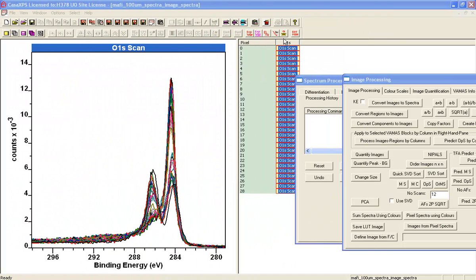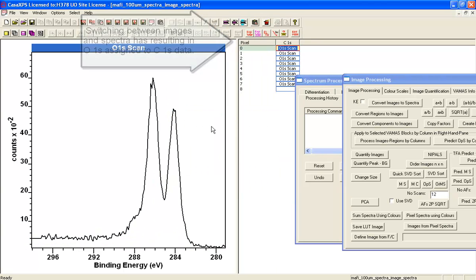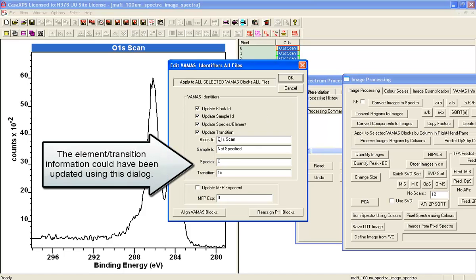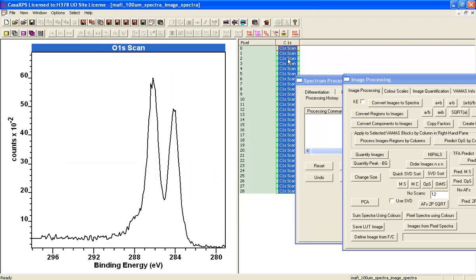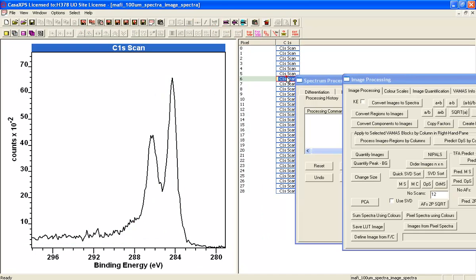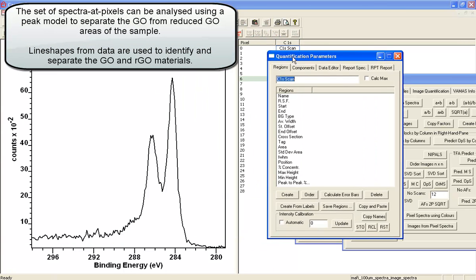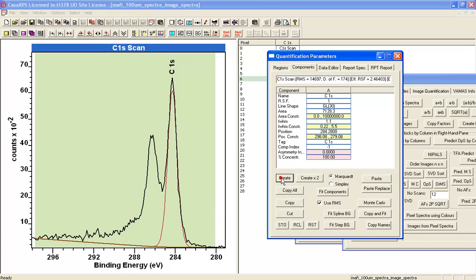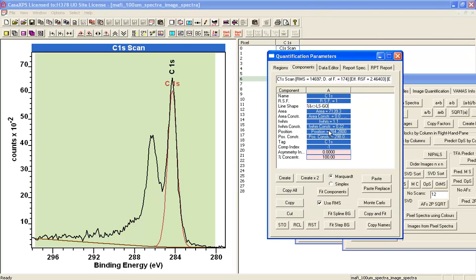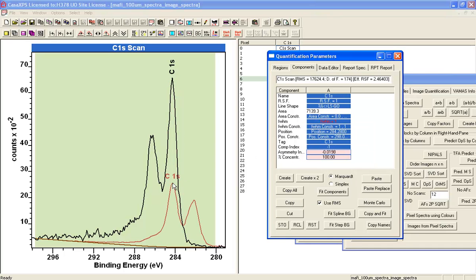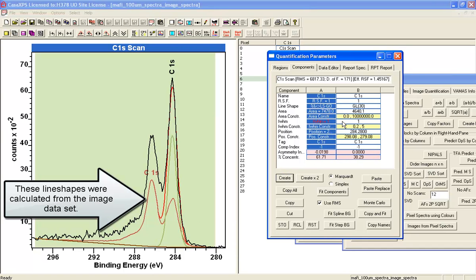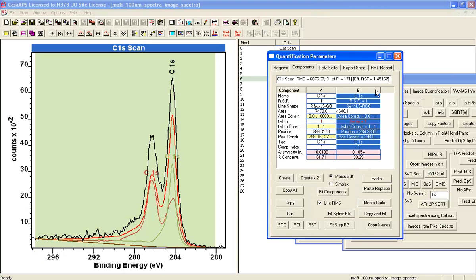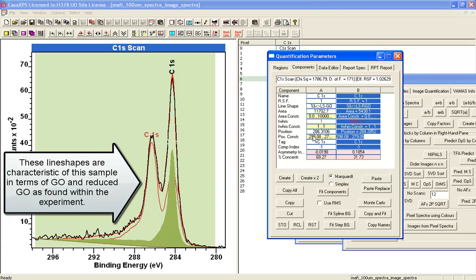The first thing we'll do is set the element transition so it's the carbon 1s, and we'll also change the object name. What we can do now is potentially do some peak fitting. Let's create a region and create a couple of components. This one's going to be a line shape from data which has previously been prepared, and the second one is going to be the reduced graphene oxide, again a previously prepared line shape which can be fitted to the data. Fix the position for these two—they ought to be roughly the same throughout.